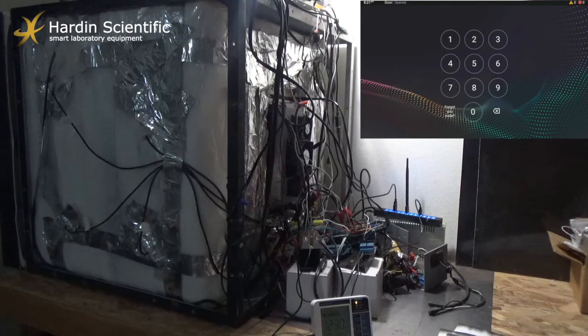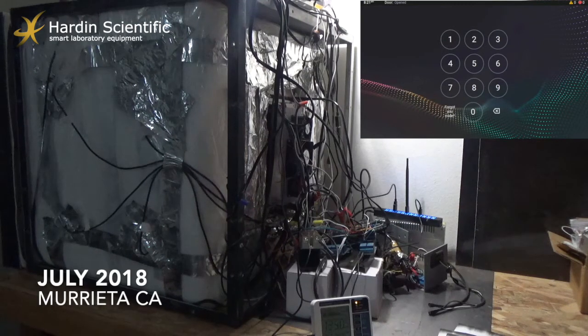Hi guys, so today I want to show you how our master application works. So we will try to create a session with our CO2 and temperature modules and just see how our system works in terms of hardware and software.